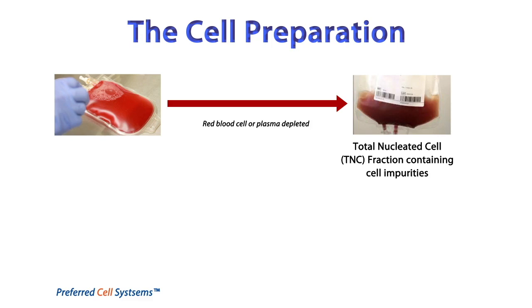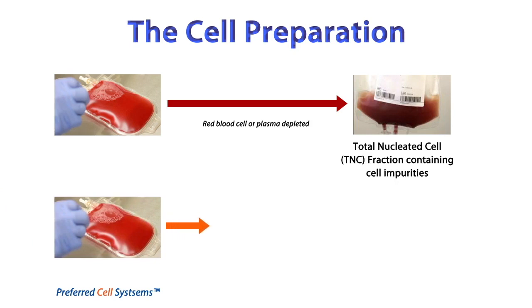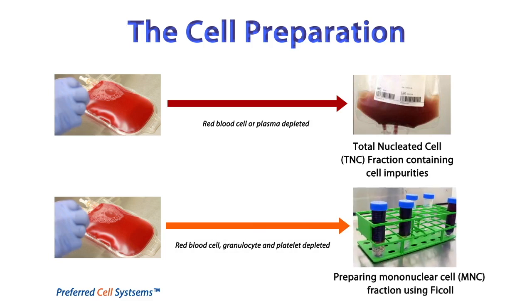These results have been published previously. For this reason, we highly recommend that both the sample and reference standard cell suspensions be fractionated to at least the mononuclear cell or MNC fraction using a standardized density gradient centrifugation protocol. This will ensure that both primitive stem cell populations will be capable of producing an adequate response or signal, providing they are not damaged or dead.